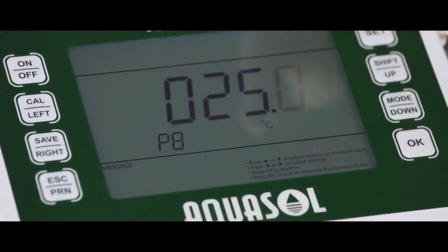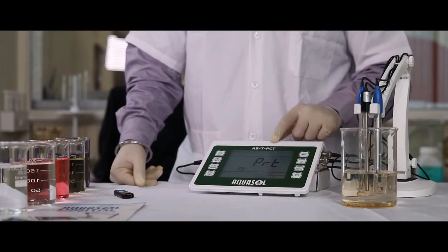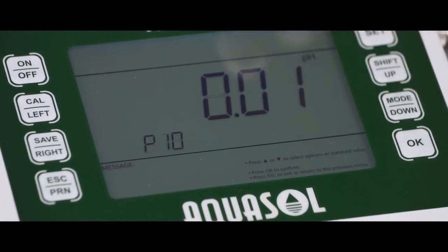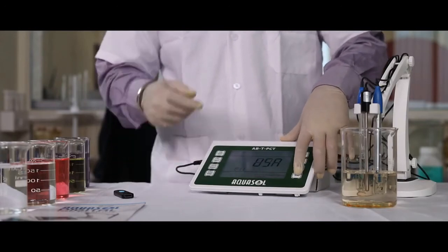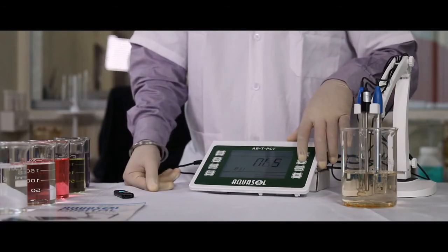P8 to enter the temperature of the solution manually. P9 to select Bluetooth operation mode to print meter readings on a Bluetooth printer, or App mode to connect to the Android app. P10 to select the pH resolution range. P11 to select the pH standard buffer range. USA is the default setting. These are the settings for pH.